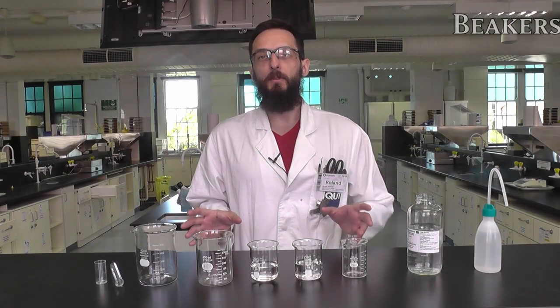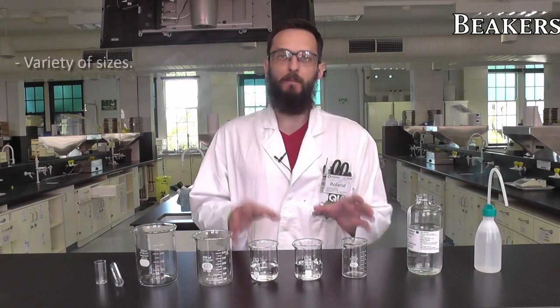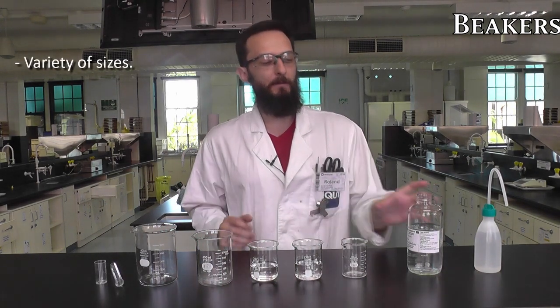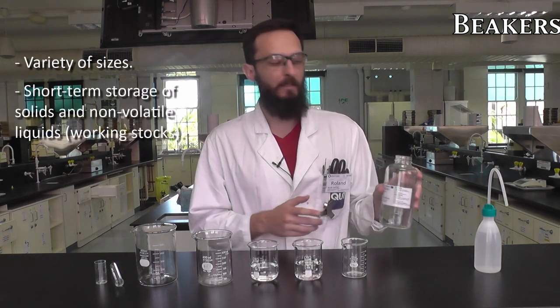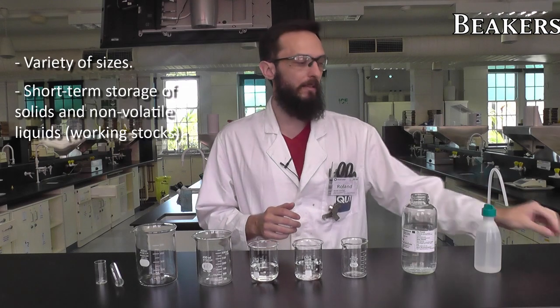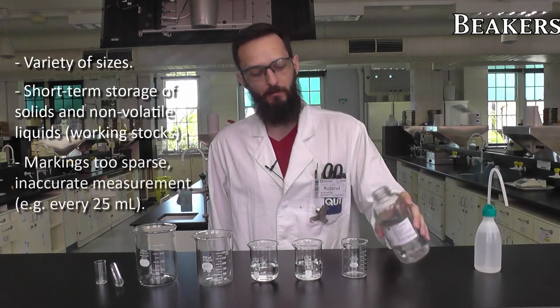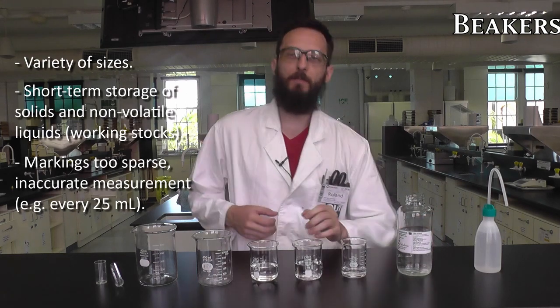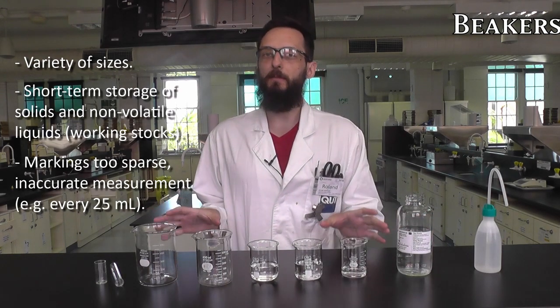Beakers are some of the most common glassware you'll find in the laboratory. They're nice because they come in a variety of sizes, and they're good for short-term storage of chemicals. If I have a nice expensive stock of chemical, I really don't want to stick anything into there that might potentially contaminate it. So we can take that stock bottle and just pour out into a beaker and use that as our working solution for the experiment. Beakers are also nice because they're very easy to clean.